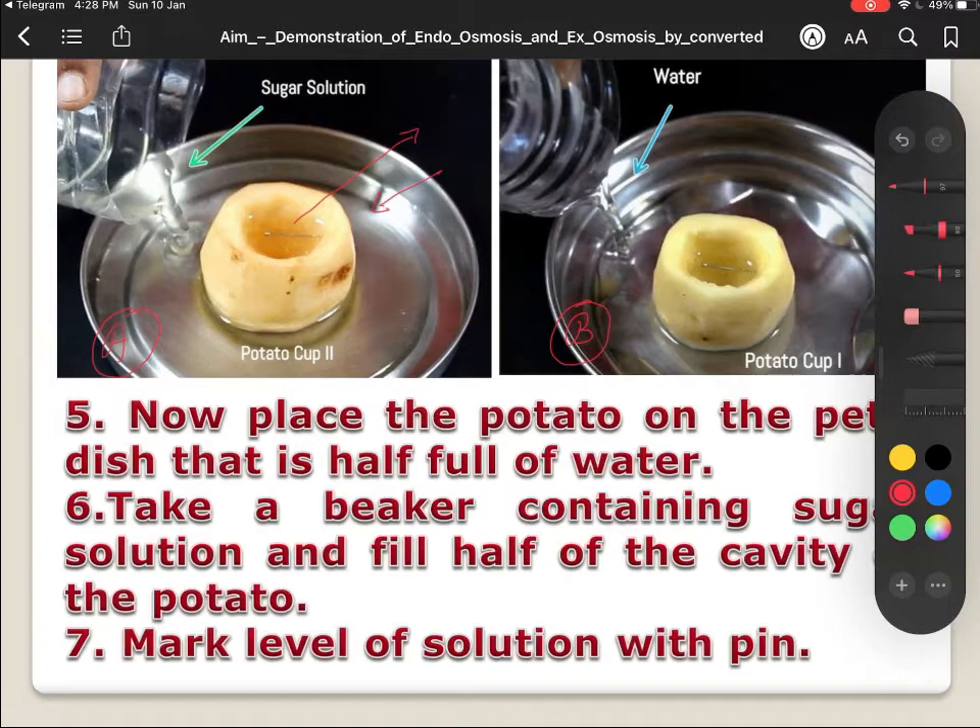In the second setup, outside water is there and inside the potato osmoscope, concentrated sugar solution is there. Now with all pins, we have to mark the level of water in experiment A and the level of sugar solution in experiment B. With this, the experiment setup is complete.